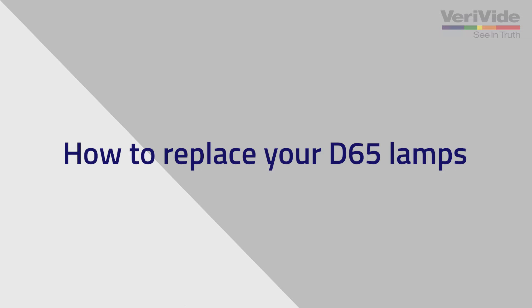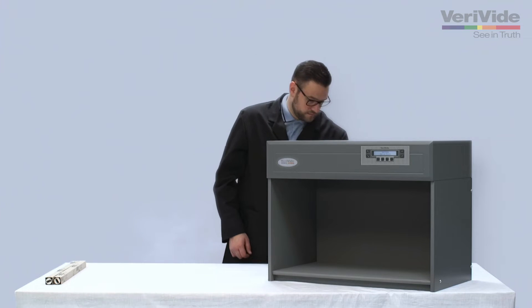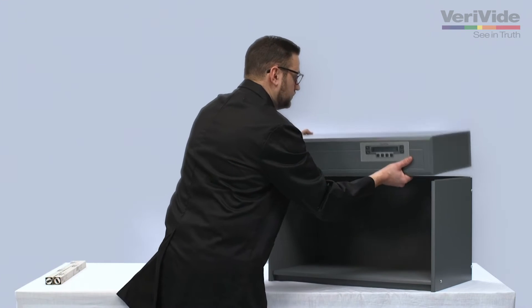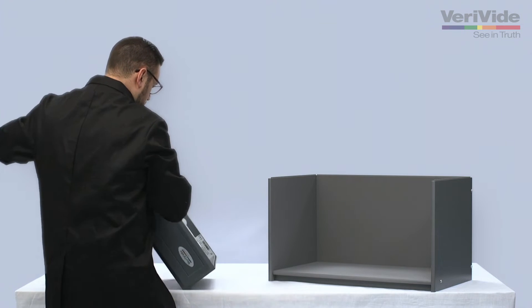Before replacing your Verivide CIE D65 bulb, first ensure the power is turned off and the lamps are cool. Next, remove the mains cable from the cabinet and put to one side. Then remove the canopy and lay down on a soft, clean surface on its top.